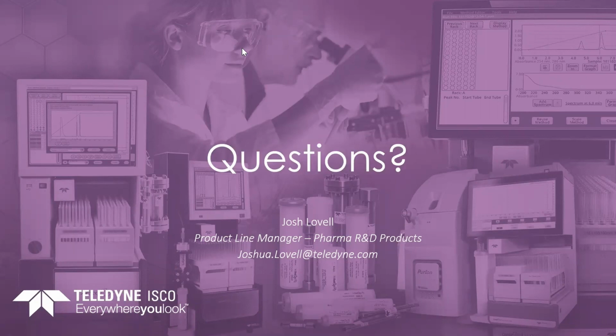Another question here is the customer here has a late eluting purification here. So their compound is coming off at about 85–95% methanol. They'd like to save solvent and reduce their method time. So what is a way for them to do that?